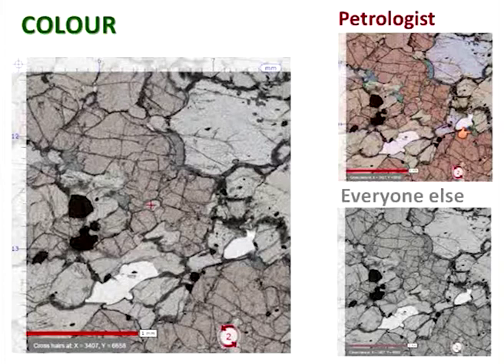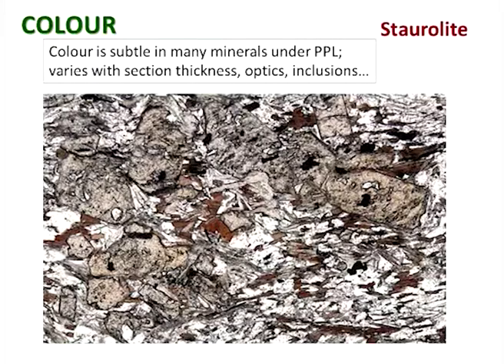So that's really the trick when you're looking at thin sections, particularly in plain polarized light. The colours are much more vivid in cross polars, but in plain polarized light you're looking for really, really subtle variations of colour, and those variations can be extremely subtle. On the mineral identification chart, for example, you get these confident descriptions of staurolite as yellow, epidote as yellow, glaucophane as blue, and garnet as pink. Well, it's really rare to see definitely pink garnets in thin section. Some of the eclogitic garnets turn up looking pink, but very often it just looks grey.